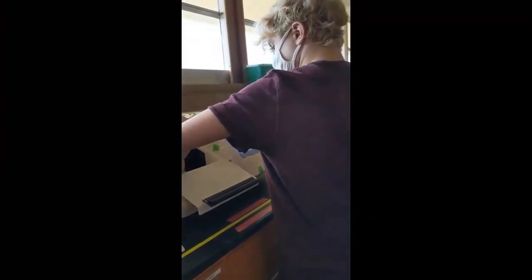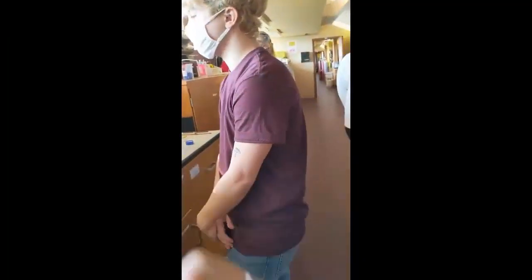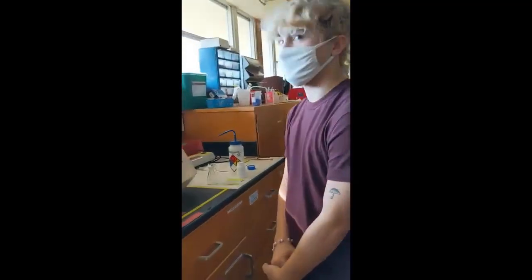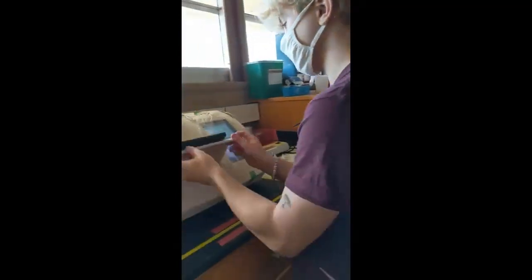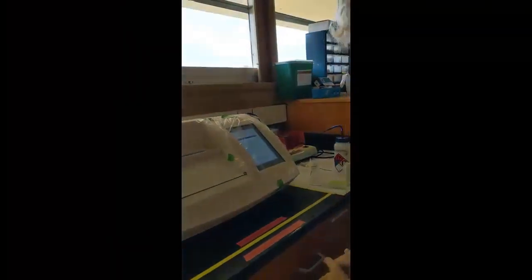In theory, I should have measured how much I put in there. We're going to pretend that I measured 5 grams in 100 milliliters of water. So you can close this again, and then you're going to click on this thing. I don't know what that symbol is, but it says scale. Then we want it to give us the rotation value, but it depends on the concentration, so I need to tell it the concentration.